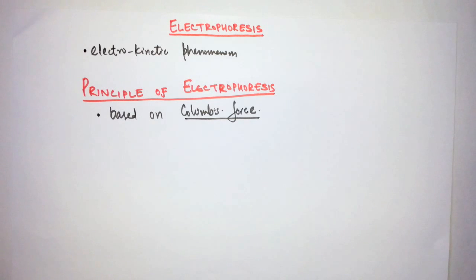And in an electric field, we encounter two main forces, and I will be discussing later what kind of forces these are. The equations of these two forces can be rearranged to get the electrophoretic mobility, and that's the main aim of this derivation. From this electrophoretic mobility, we'll get the velocity of the ions in electrophoresis. So let's derive this electrophoretic mobility, which will be our main aim.